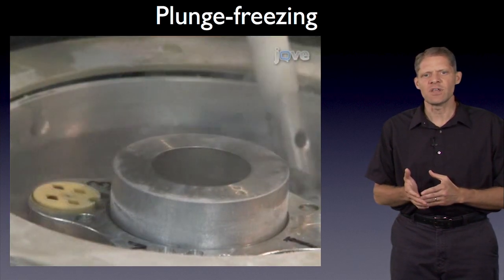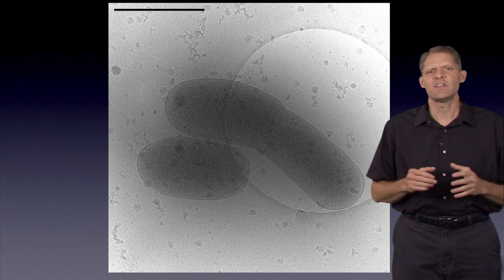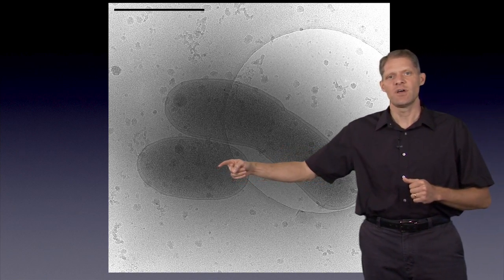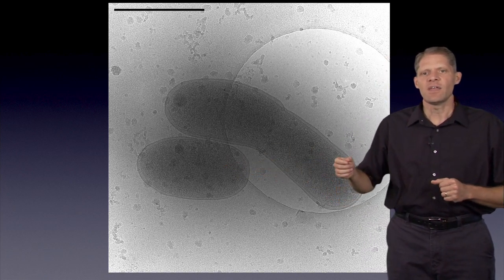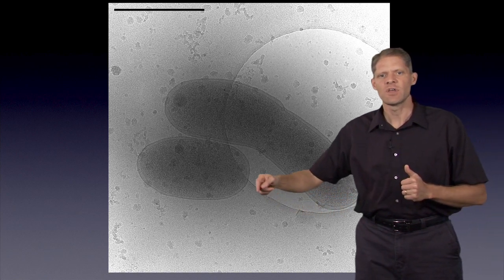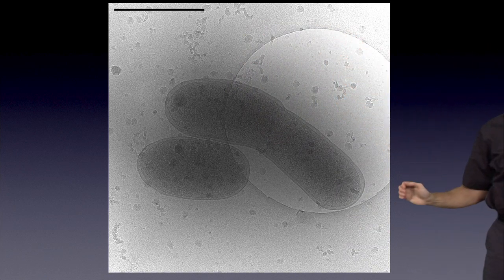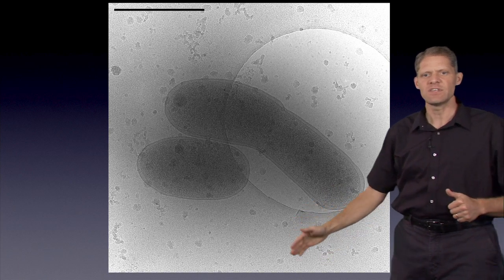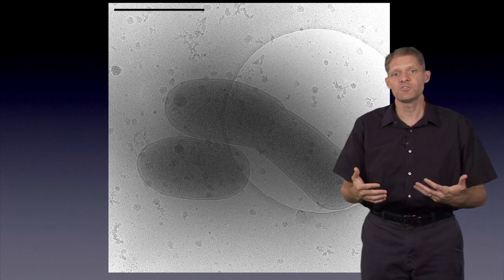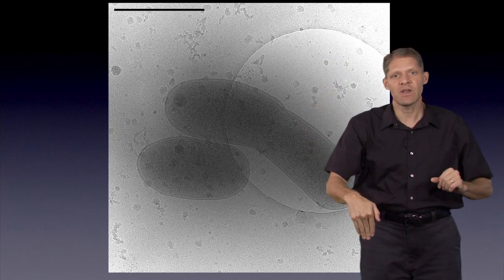Once it's plunge frozen, it needs to be held in that frozen state. So this is an example image of two bacterial cells that have been plunge frozen across an EM grid. In this case, we use the EM grid type called Quantifoils that have circular holes in the carbon film surrounding them. So that's a circular hole in the grid surface itself. The rest of this is a carbon film. And we simply took a growing bacterial culture and spread it into a very thin film across that grid and then plunged it into liquid ethane.